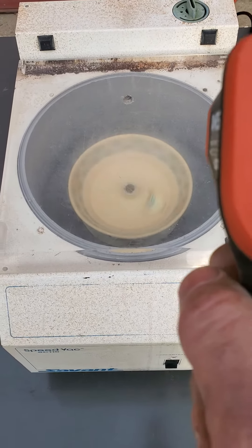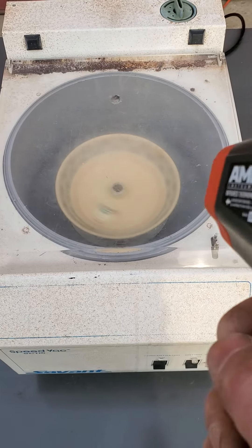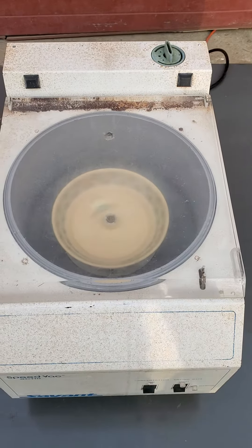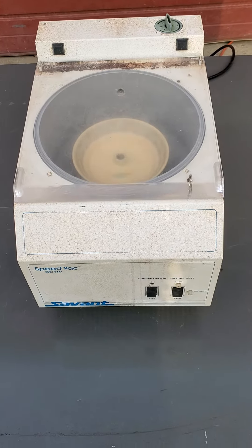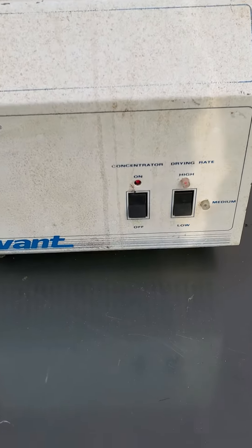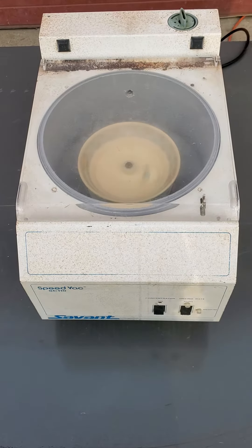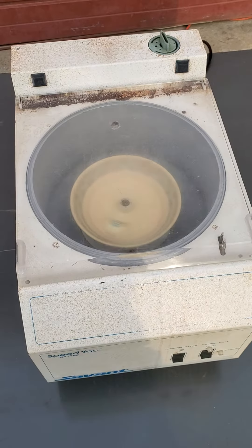It's very silent, doesn't make much noise. I can't get the thermometer reading because of the lid. As you can see, it spins perfectly — nothing wrong with it. Real nice unit. The heat is on.